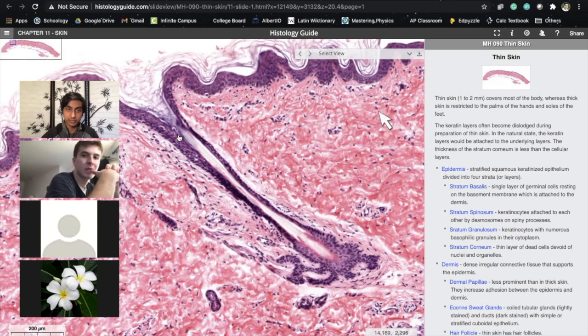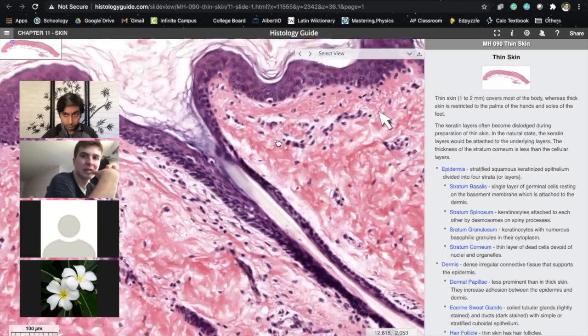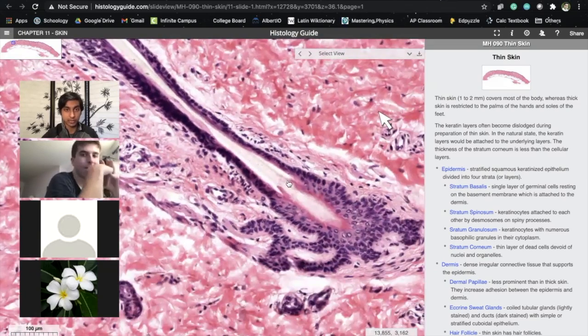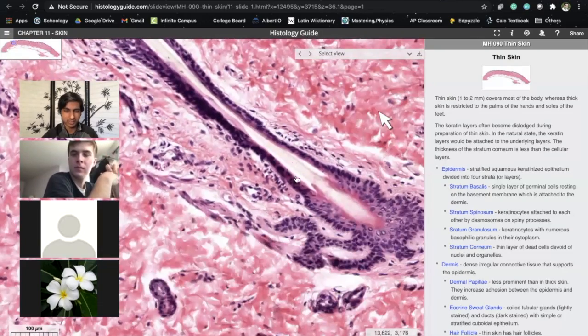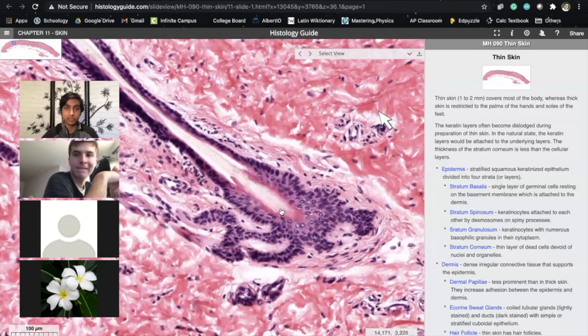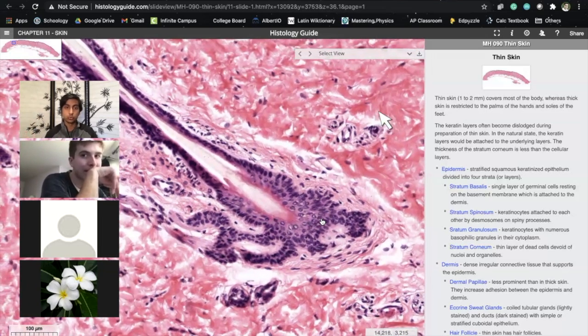And notice how it's surrounded by the cells, which we would consider the same type of cell type as the upper epidermis, which is our upper layer here, right? And so you can see this purplish color. Okay. And so that actually stretches down because you have the hair follicle here. And here is the hair itself. You can tell, but don't think about it too much. And then the base is where you have the generation. And so there are a lot of particular cells here that are responsible for creating that environment where the hair follicle and the hair can eventually grow from.